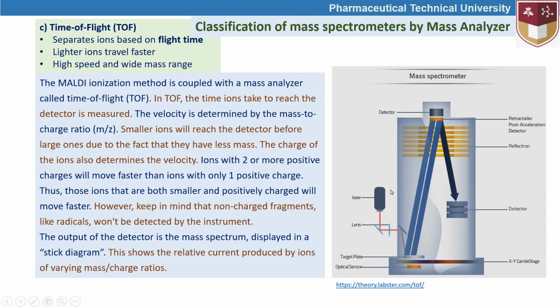Here we can see, by using MALDI on the plate, as we talked about in our first lecture on mass spectrometry, the mixture of the matrix and the analyte is hit by the laser. They are subjected to the volatile state.